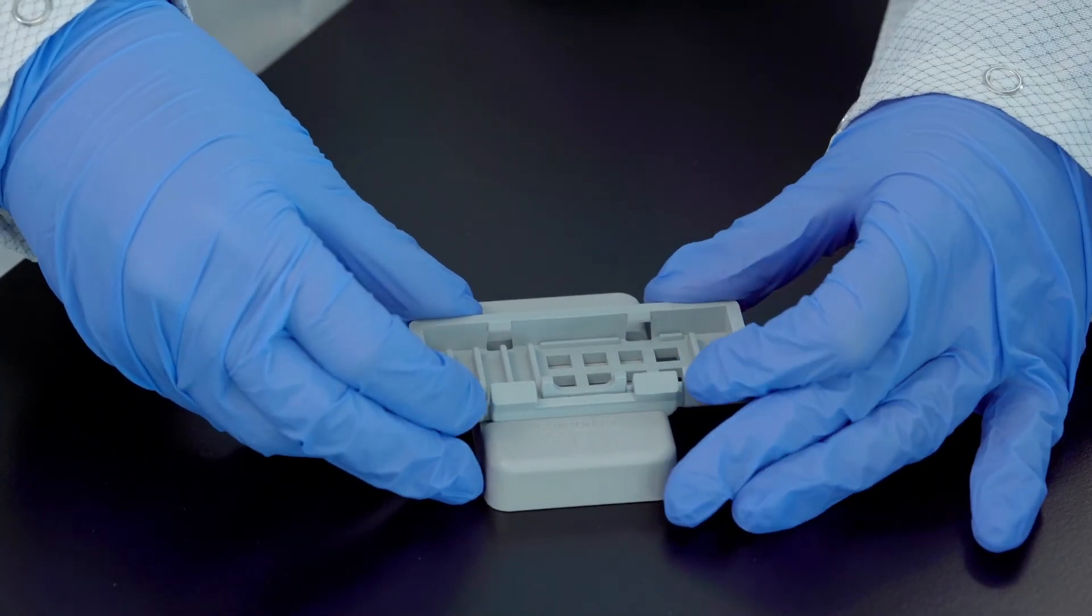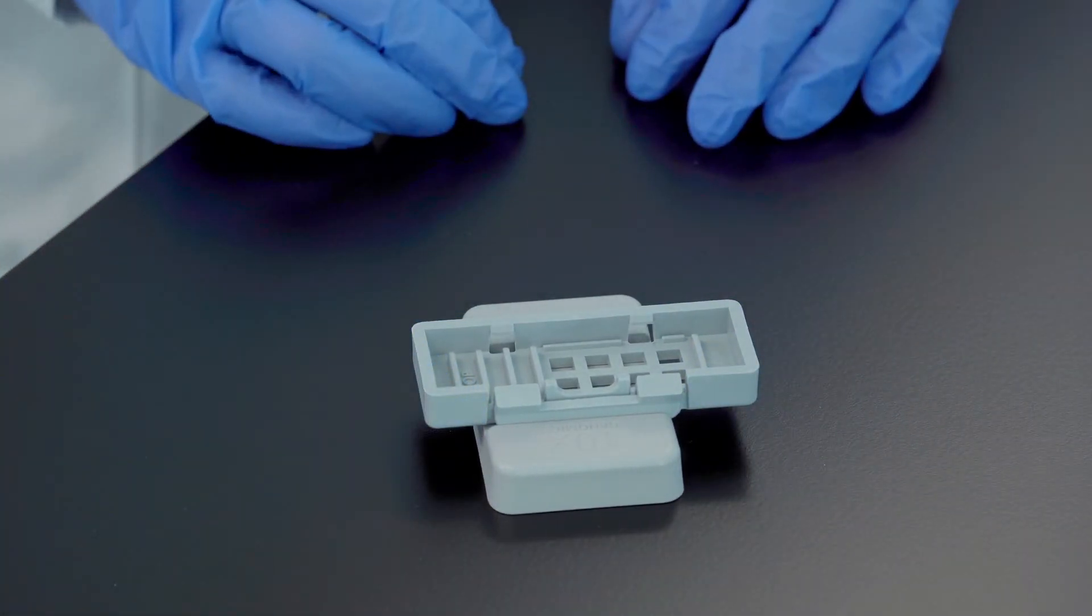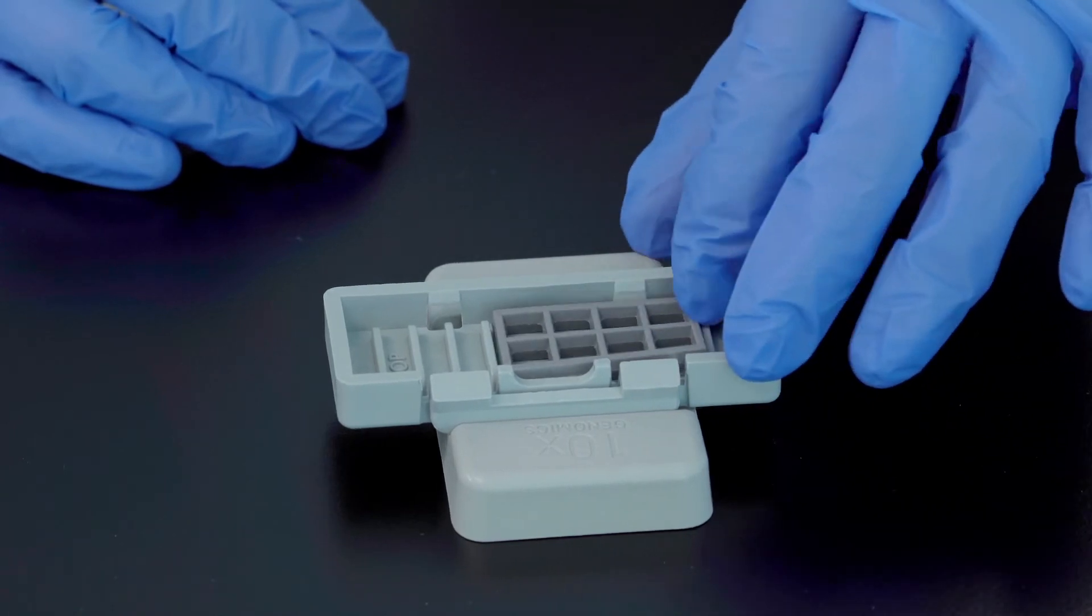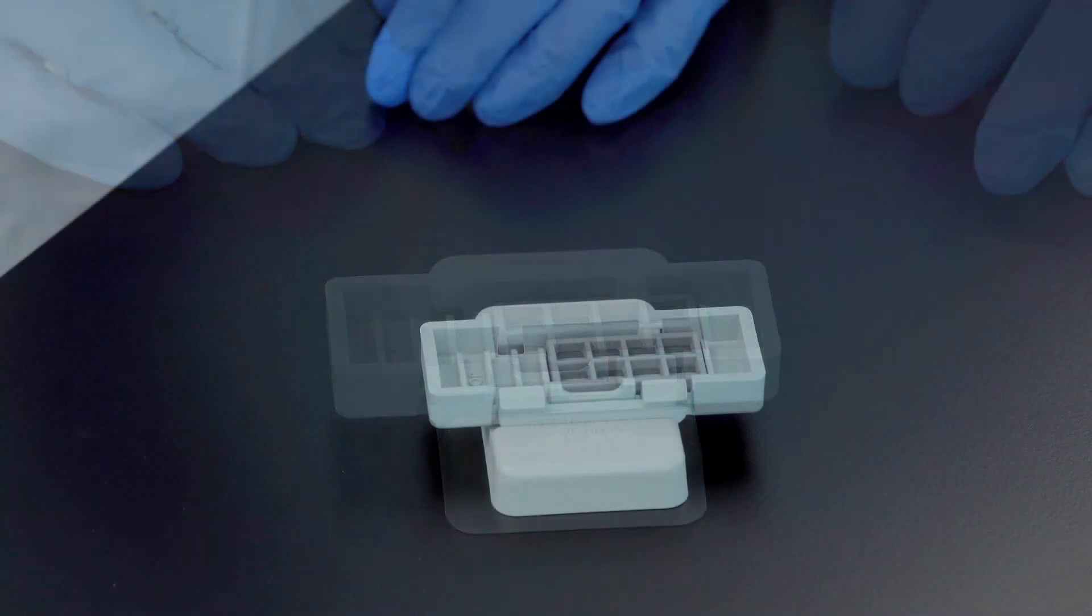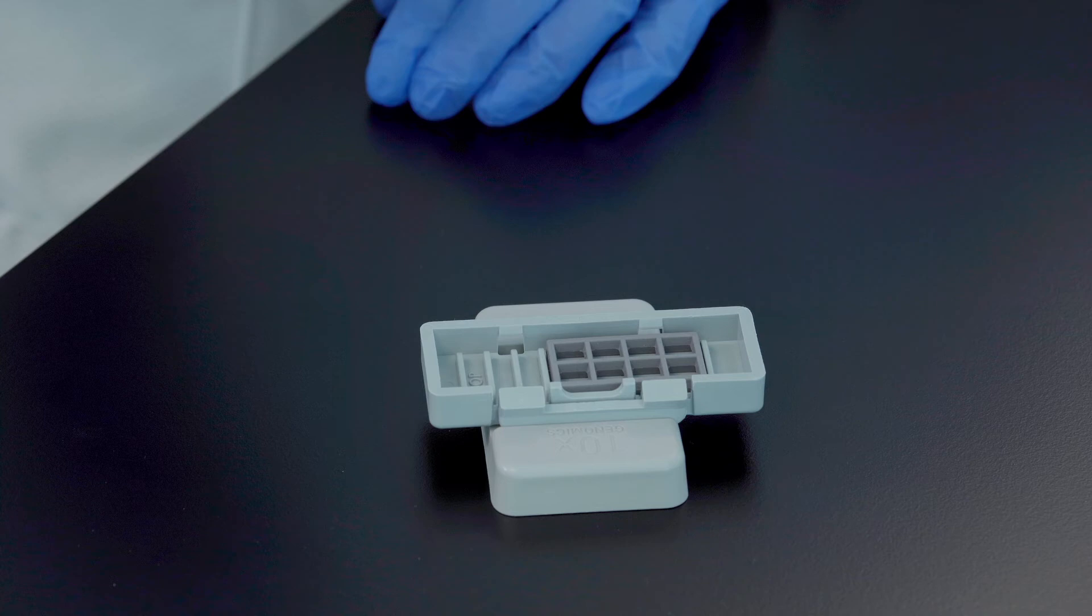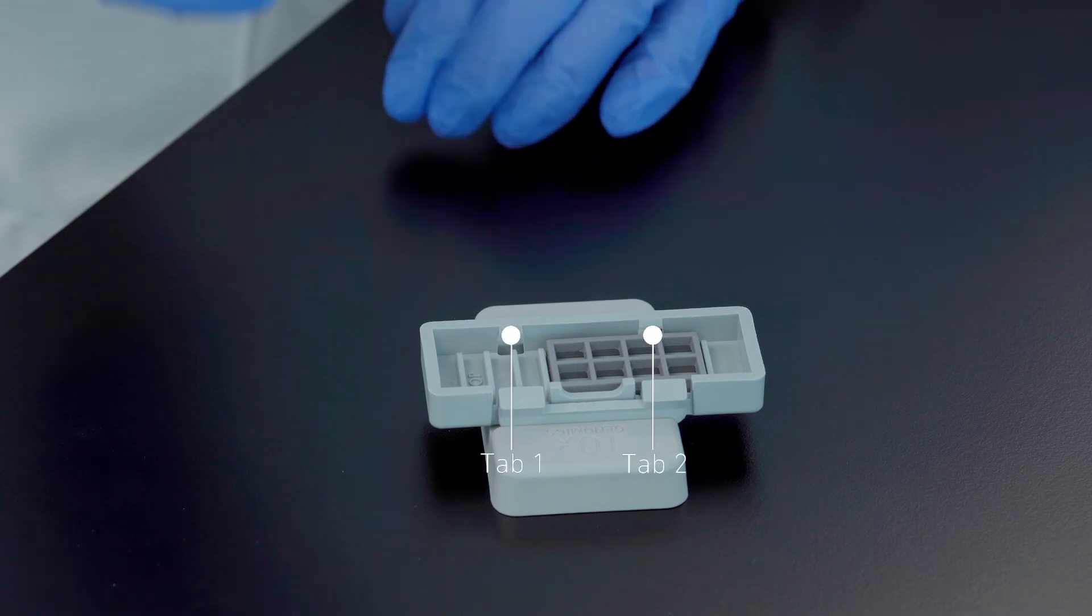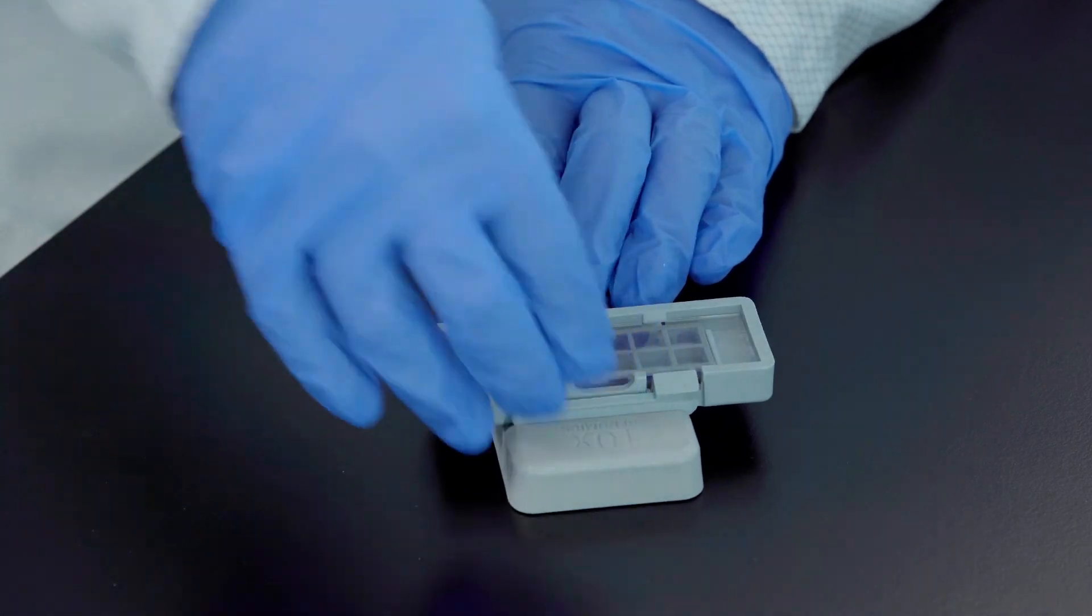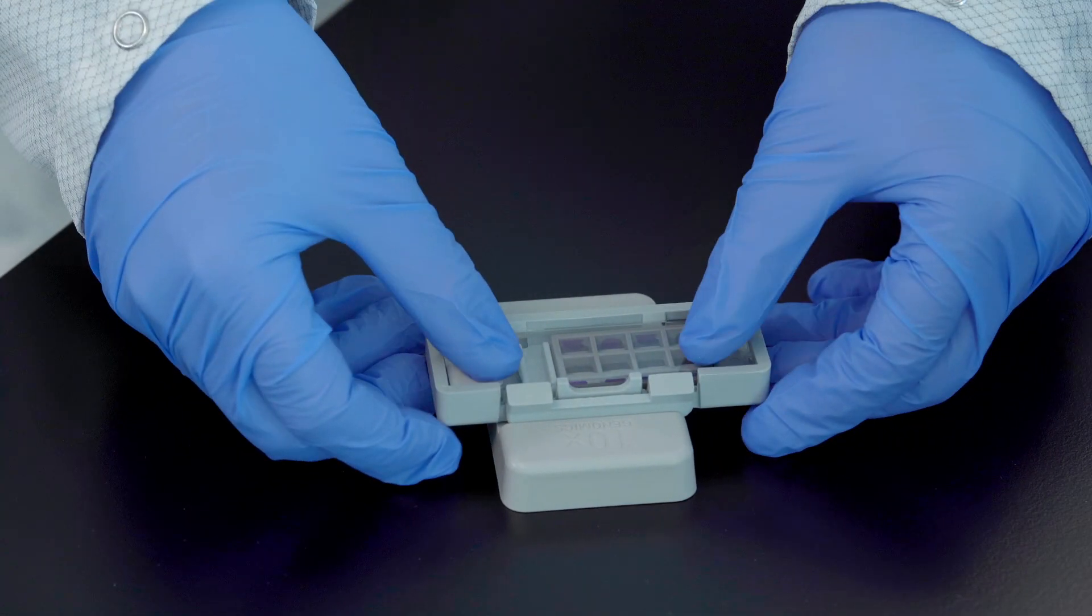The slide cassette is now secured on the alignment tool. Position the gasket to align with the slide cassette cutouts. Insert the long edge of the slide under tabs one and two. Ensure that the slide is flush. Press the slide down until it is flush with the gasket and under tabs three and four.